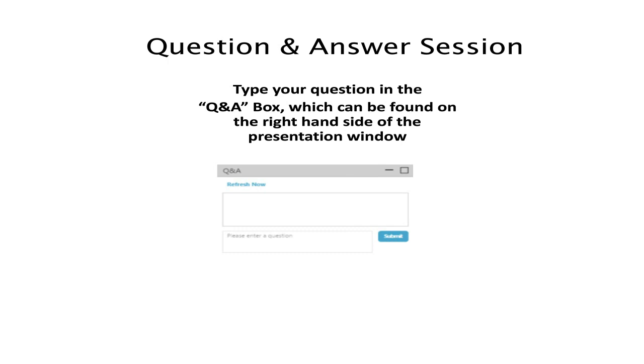The next question is, which minimal microplastic size can we expect to determine using the Spotlight 400? With the Spotlight 400, that all depends on, I guess, how you would define identification, in that if you need a precise measurement of particle size from the infrared image, there is a lower limit which you would achieve there simply because of spatial resolution in combination with whatever sampling technique you employ.